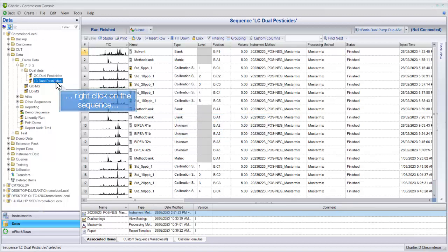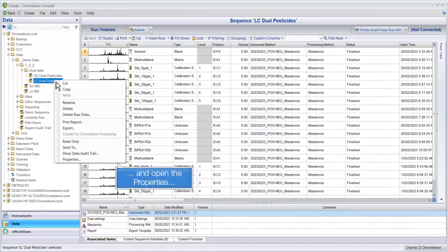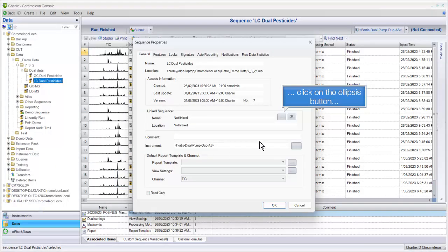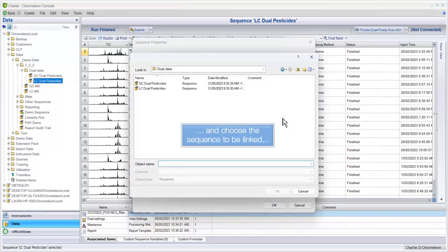Right-click on the sequence and open the properties. Click on the ellipsis button and choose the sequence to be linked.